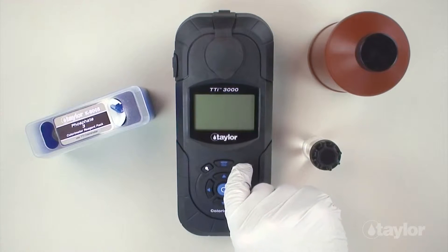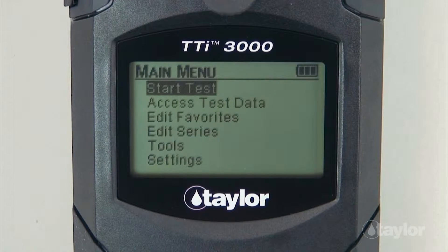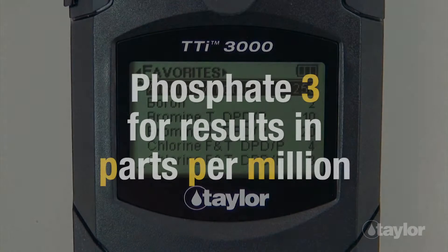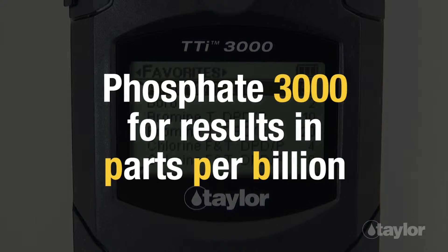To begin, press the power button to turn on the colorimeter. Press the main menu button and select a test menu — All Test, Recent Test, or Favorites — containing Phosphate-3, which will display results in terms of parts per million. You may also choose Phosphate-3000 if you want results displayed in parts per billion.